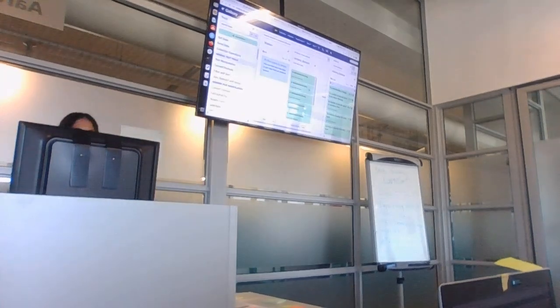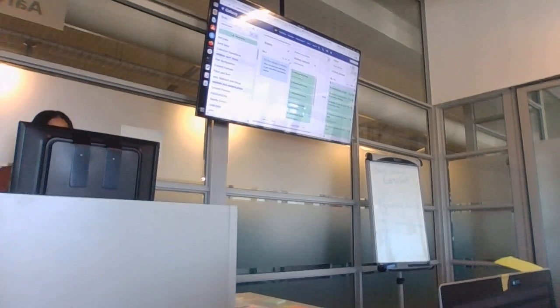Okay, so then we are going to take, is everybody here? You're going to take this and drag it over to your Kraken.